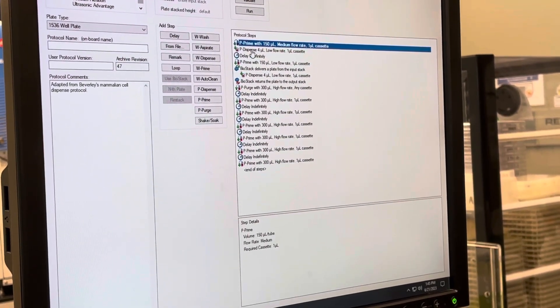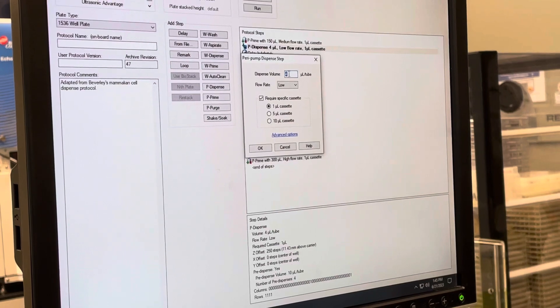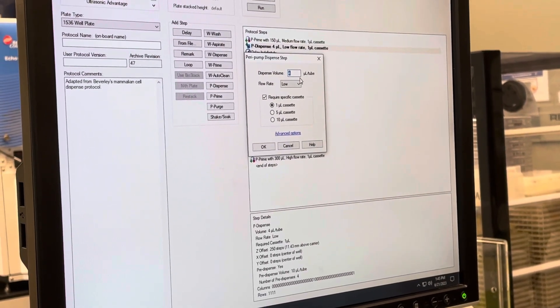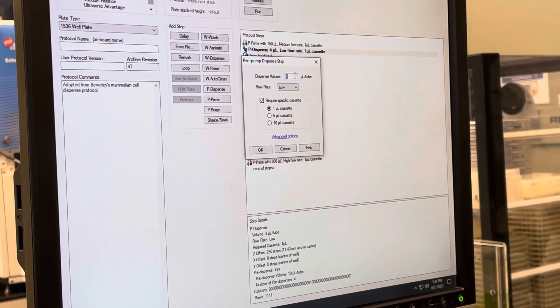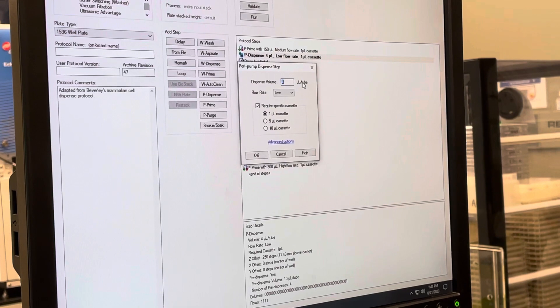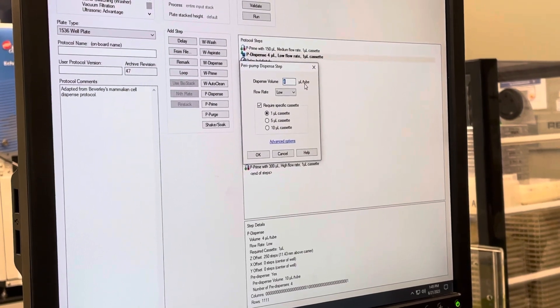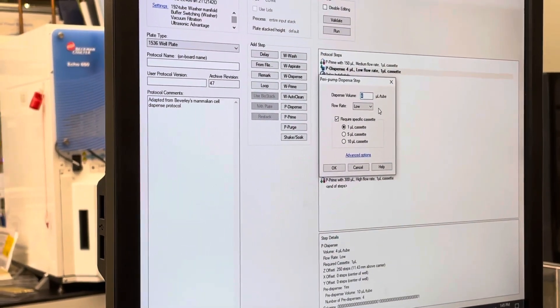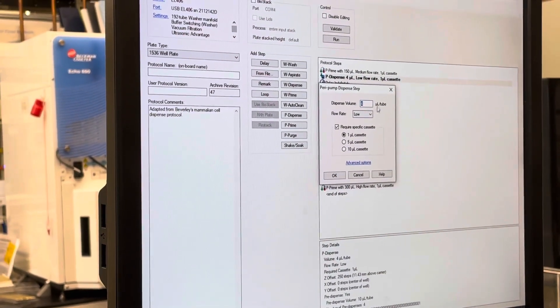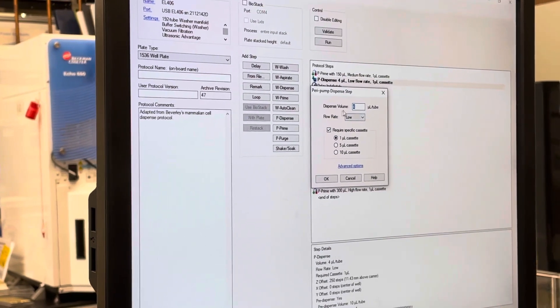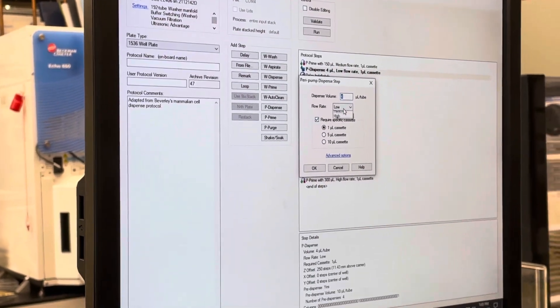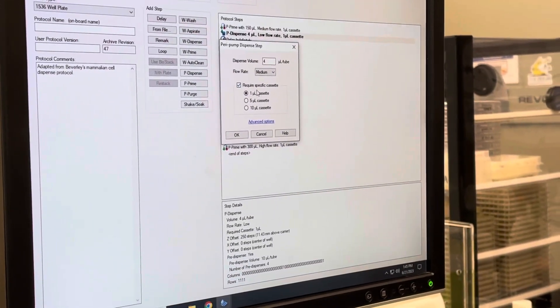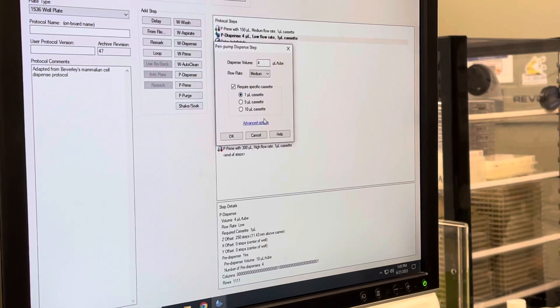After the prime there's a dispense step. It's going to dispense 4 microliters per well — it says per tube because each tube is going into a well, but really it's the well that you care about. Let's try medium speed with the 1 microliter cassette.